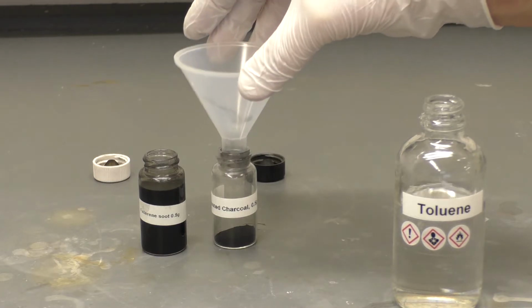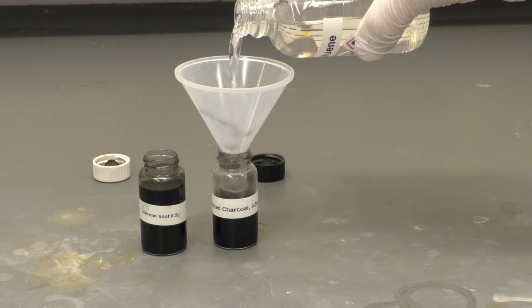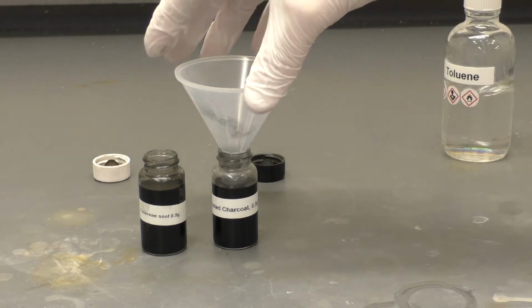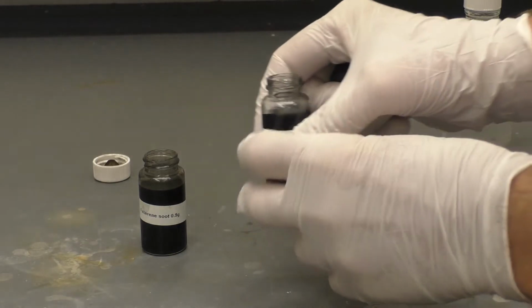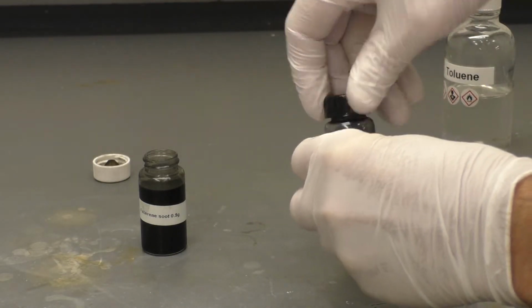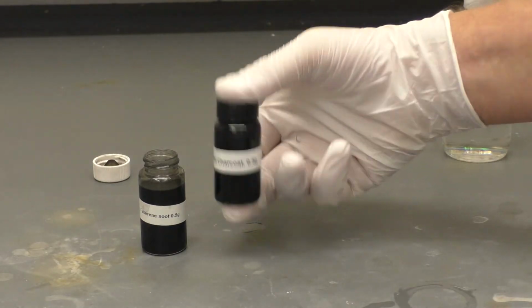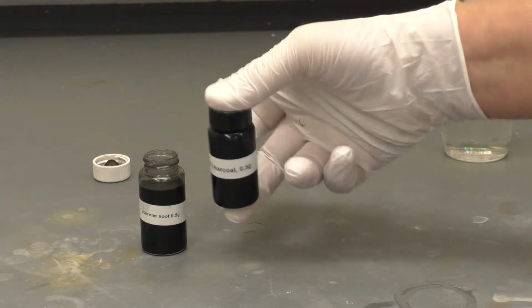So if this works, this is what we would call an extraction. We're going to selectively extract a component out of a mixture or some other residue. So we'll give that a good shake just to mix the solvent with the particles.